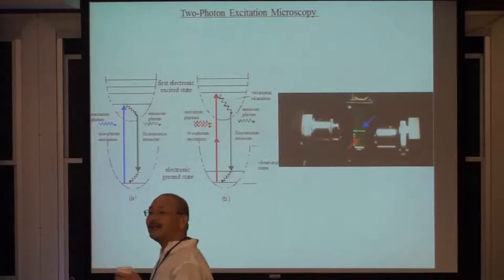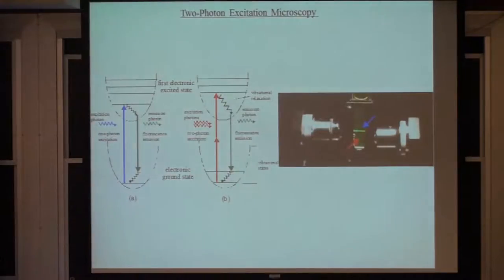So the second technique that I want to tell you about is multiphoton, also typically called two-photon microscopy, which is based on how you generate excitation. The idea is to generate excitation using nonlinear optics.